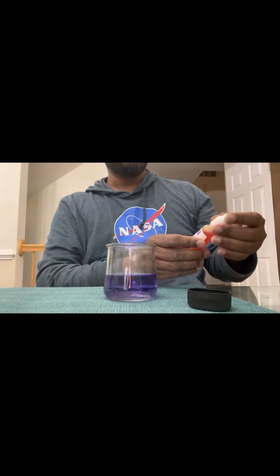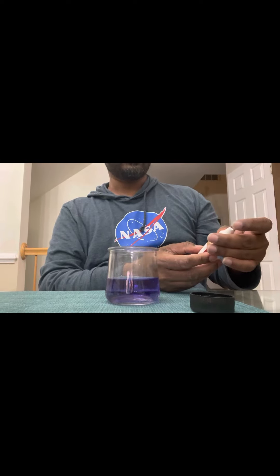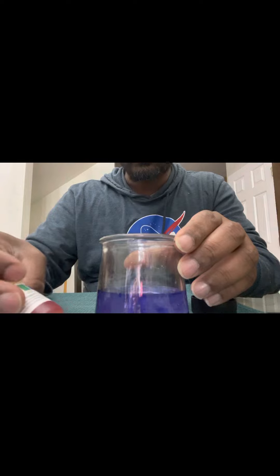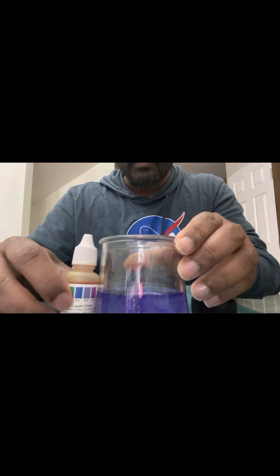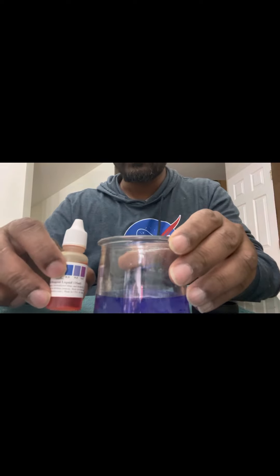It's really good. If you see the color of the water, it's close to 9. A value of 8 is a deep blue, and 9 is close to purple. So they're actually really alkaline water — good job.